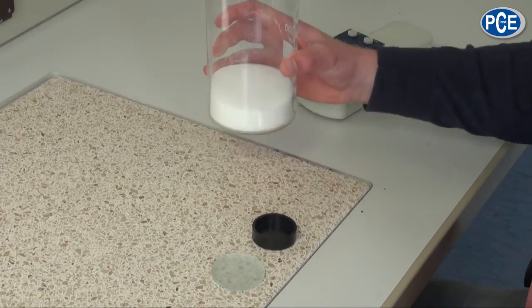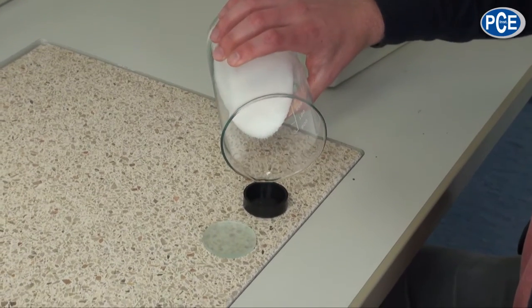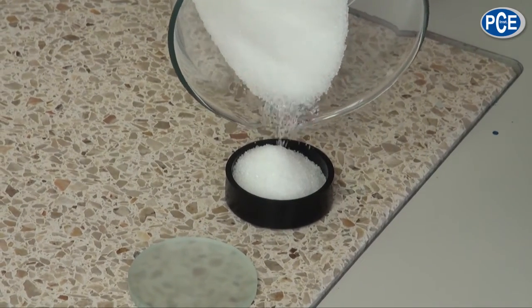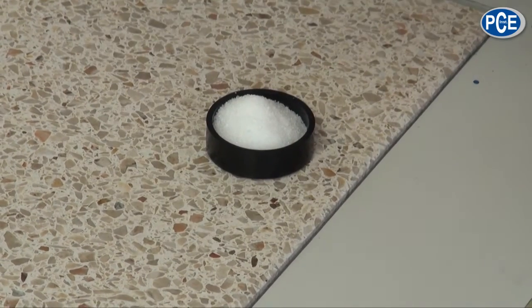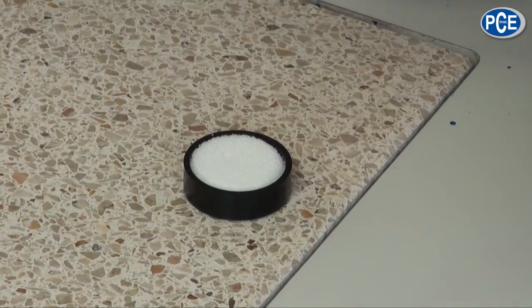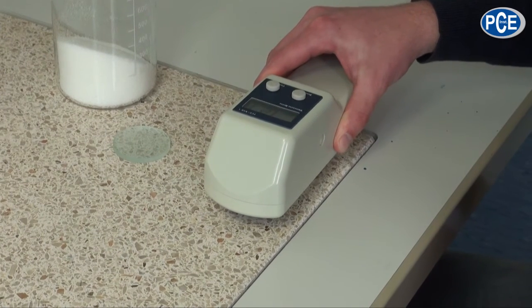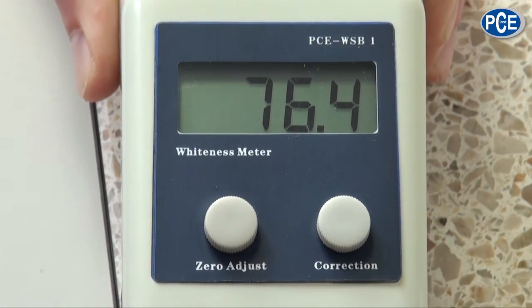Now we will do a measurement with a powder-related material — in this case it is sugar. For this we pour a certain testing amount into the test box. The box should not be filled above the overflow rim. After this we use the glass plate and press the powder flat so that we have an even surface. Then we can use the measuring device to determine the whiteness of the powder. As soon as the measured value is stabilized on the display we can read it — in this case it is 76.4.